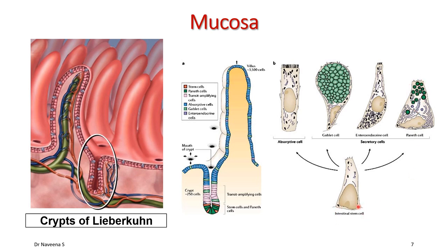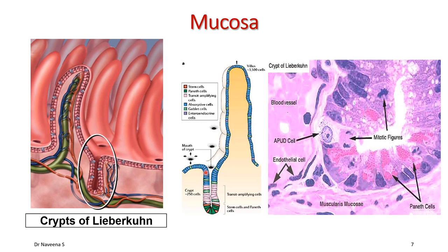All such cells are derived from intestinal stem cells seen at the bottom of the crypt. The stem cells give rise to two functional types: absorptive and secretory cells, so the crypt of Lieberkühn is essentially an intestinal tubular gland. An H&E stained slide under high power showing the bottom of the crypt identifies absorptive columnar cells, stem cells, goblet cells, APUD cells as an example of enteroendocrine cells, and Paneth cells identified by their eosinophilic granules in the cytoplasm.